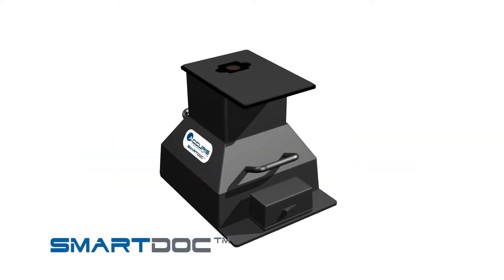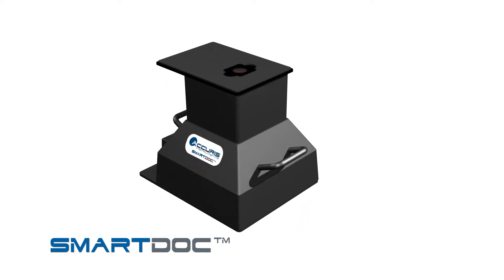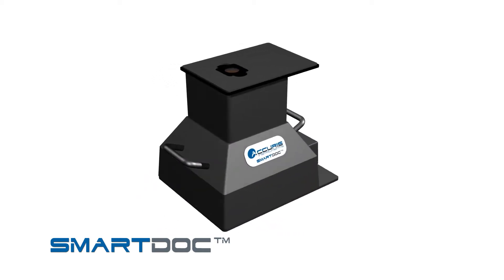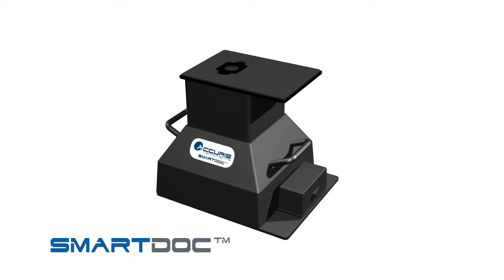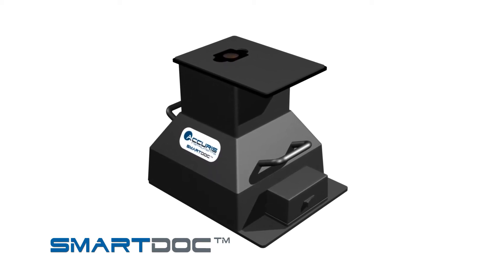Introducing the SmartDoc 2.0 gel visualization and imaging system. This innovative system allows you to view your stained gels, cut out DNA bands, and take pictures of your gels simply by using your smartphone camera.